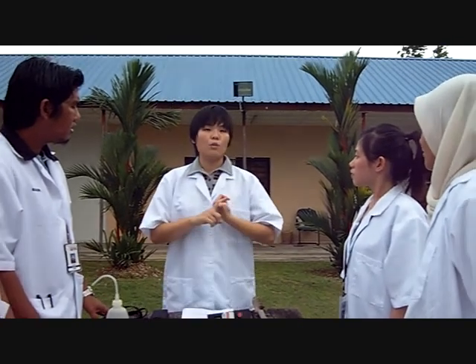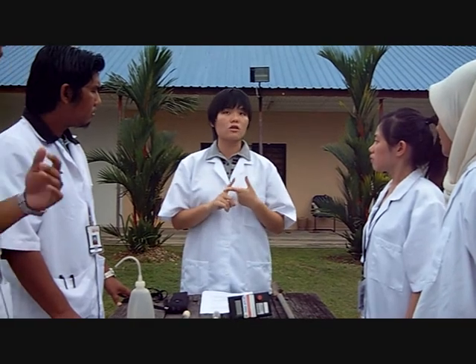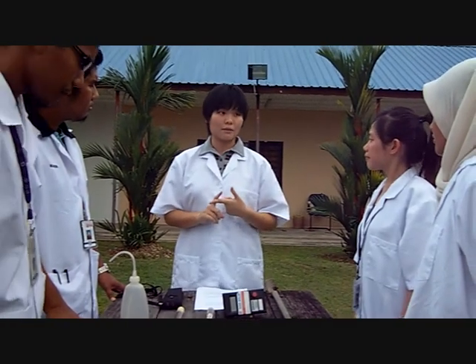For the first part, we will be measuring relative humidity, while for the second part, we will be measuring soil water retention. Let us start with the first experiment.